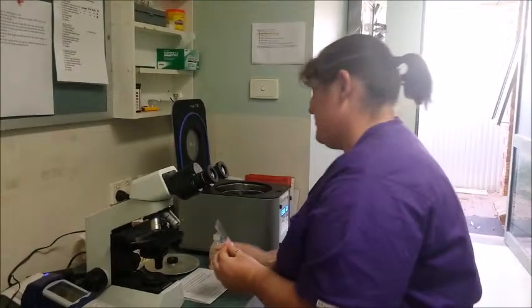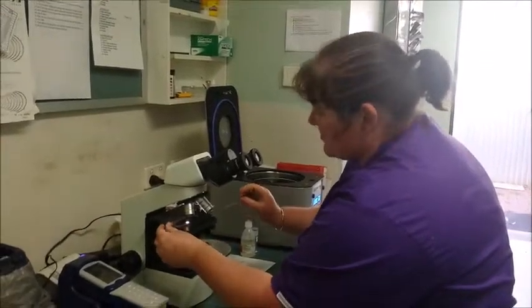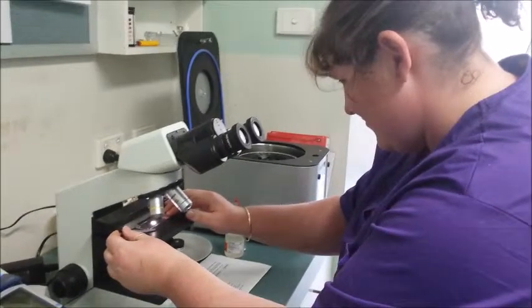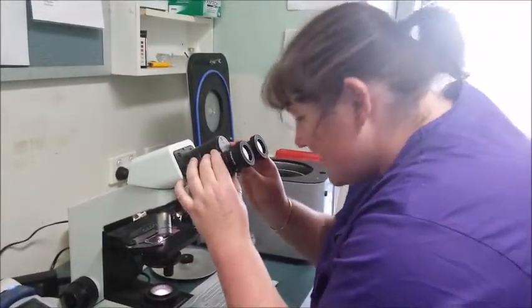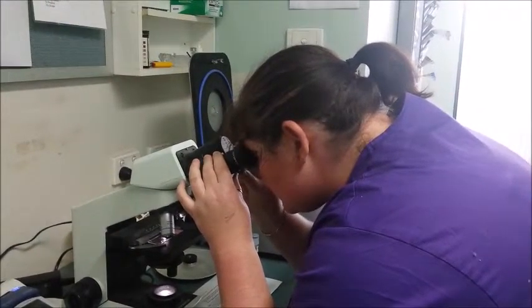We're setting up a slide on the microscope. Turn your microscope on, pop your slide on, switch it to 10 magnification, and adjust your eyepieces so you have a single field of vision.